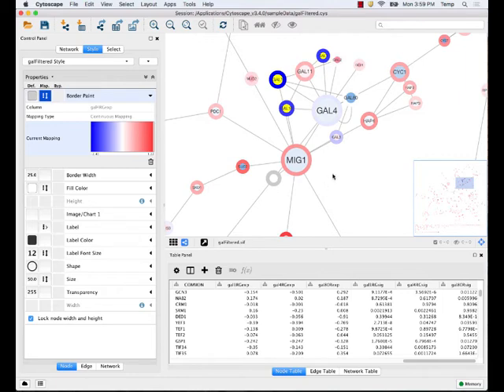You can actually plot a time series as a chart in the software, and each node will get a little chart on it. There's a whole range — pie charts, line charts, and bar charts. This is the real power of Cytoscape: this Style panel where you can take any data and map it to any visual property. There are lots of different visual properties available: colors, widths, shapes, line thickness, and so on.